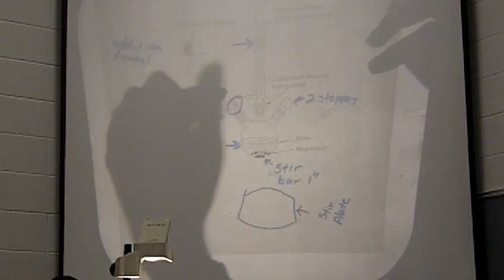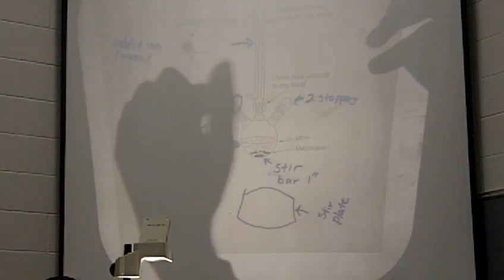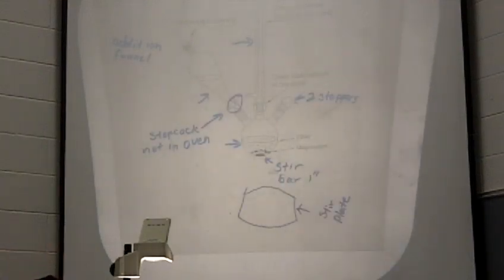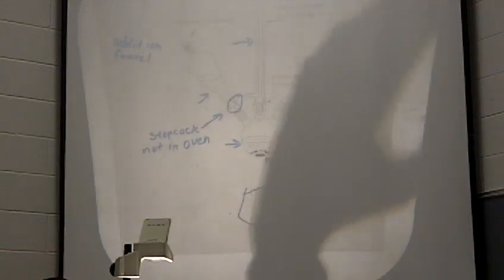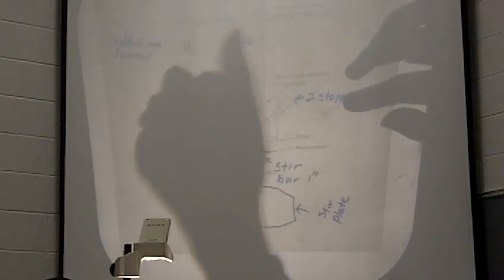So I put the 40 mL of anhydrous ether in here, and then put your alkyl bromide in here on top of that. The alkyl bromide's heavier than the ether, so it'll go through the ether and mix with the ether as it goes through. Then you don't have to worry about making this solution. You'll just make it in the separatory funnel, okay? Now, before you put anything in here, make sure that stopcock is closed.